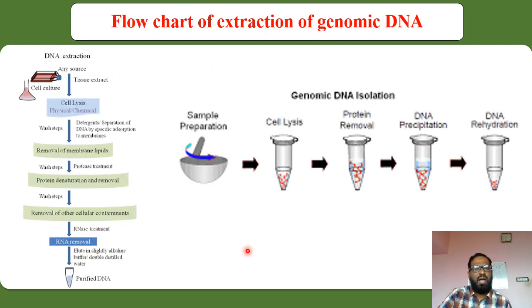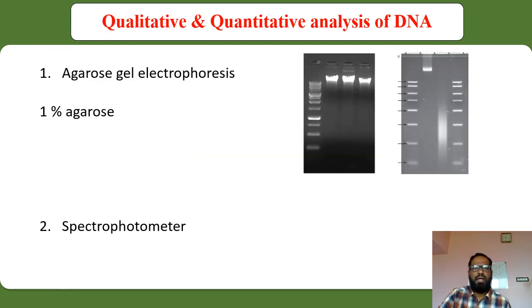And this is just a flow chart of the extraction of the DNA molecule. Here, whatever we have discussed, all those points we are representing in a flow chart. And this is the diagrammatic representation of the extraction of the DNA from the genomic DNA.